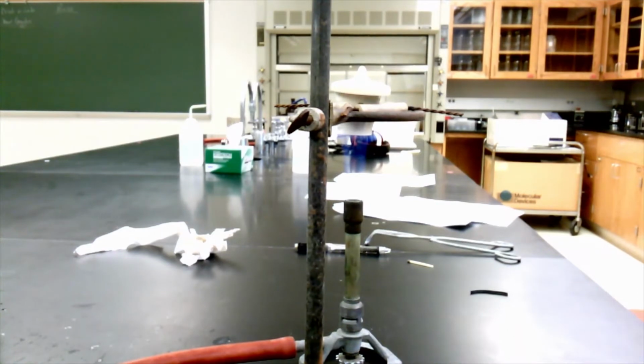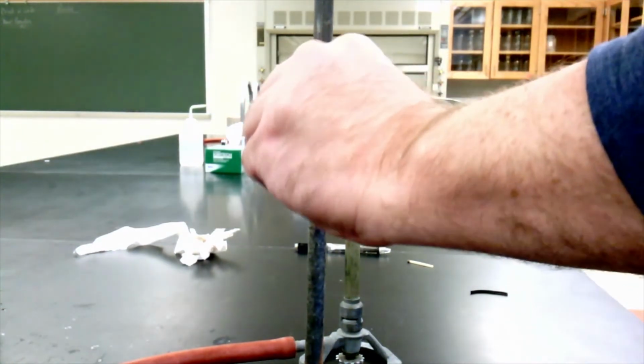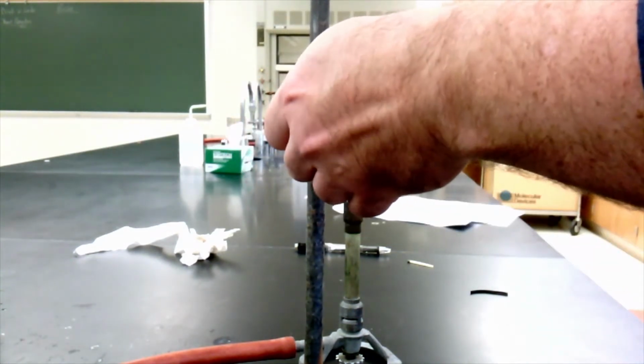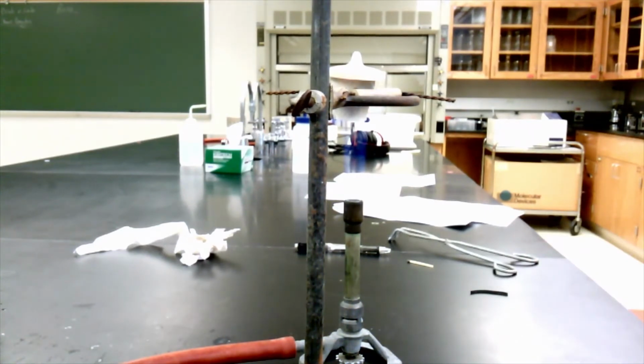Well, my crucible's making noises on me over here. I don't like that. Maybe we're a little too deep in the flame here. What was I saying? You don't want to weigh things when they're hot because, one, it can mess up the balance, and two, the convection currents that you get from having hot air surrounded by a mass of much cooler room temperature air will cause the scale to fluctuate quite a bit. Okay, so we'll be back when we're ready to obtain our next mass.